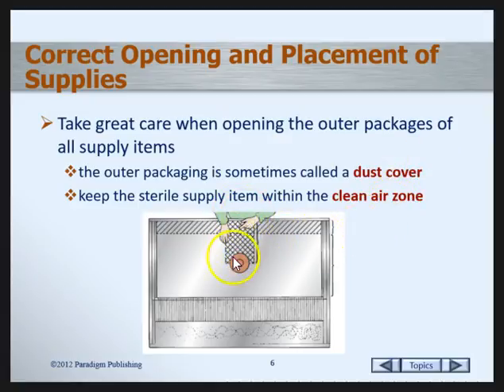To prevent shadowing, as discussed in Chapter 2, you want to prevent placing anything behind items that are placed into the DCA. Keep all items in packages on the outer 6-inch zone closest to the edge of the hood. Even though we will wipe them down with sterile IPA, they are still considered to be contaminated.